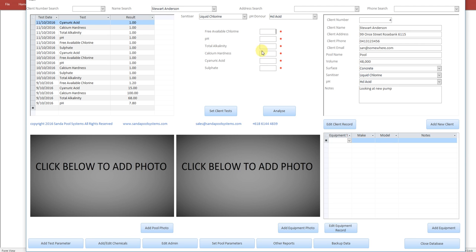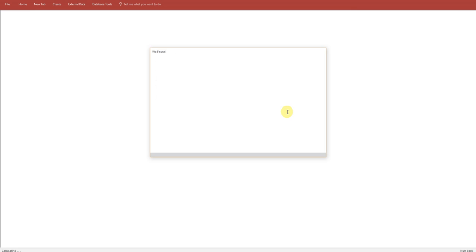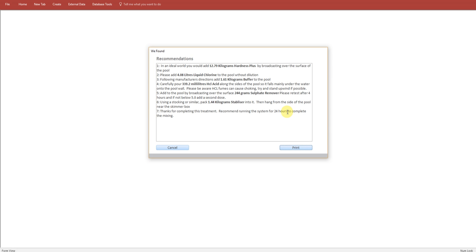As you're probably aware by now, you can enter your data and click through for an analysis and get the outcome, make some alterations of the formulas.